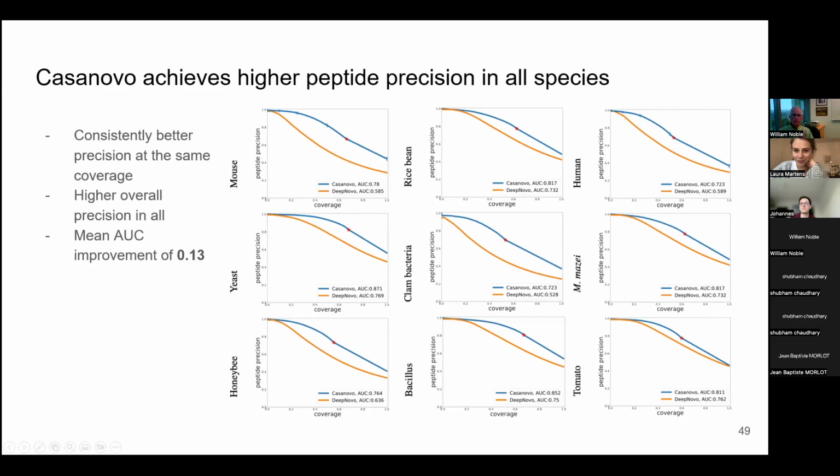We also can measure performance at the level of amino acids. For each peptide sequence, you can ask how well we predict the amino acid at each position. So, for instance, if we predicted almost the correct peptide but swapped the position of 2 amino acids, then you can get it sort of 80% correct.